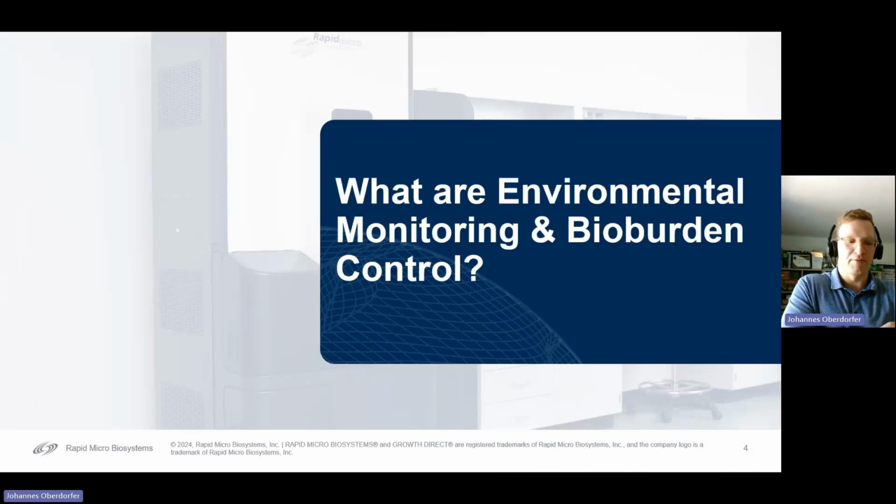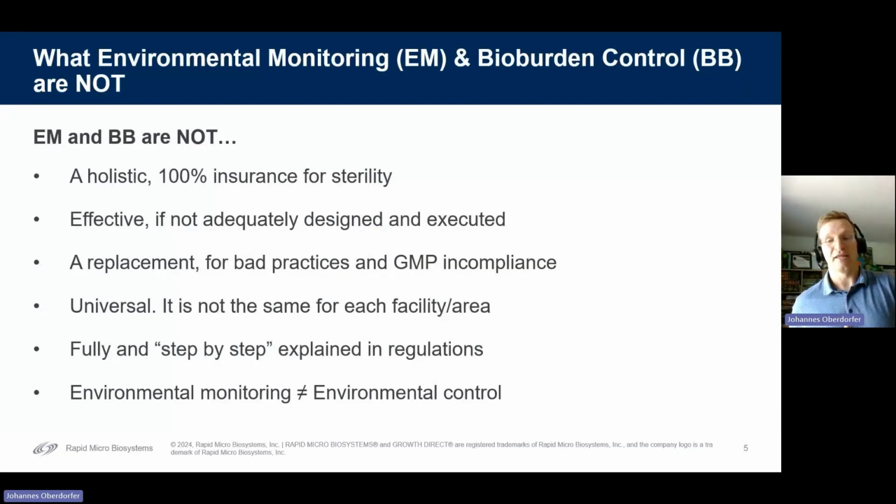So what are environmental monitoring and bioburden control? Definitely they are not holistic. I found with many different companies the thought that if I have an EM regime in place, then I am in control of everything. In the best cases this might be true, but generally it's not. It's not a 100% insurance for sterility.